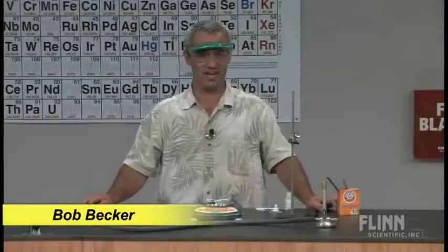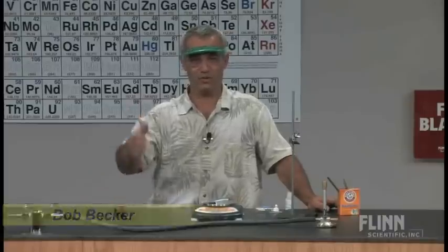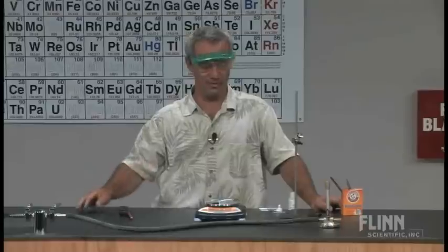So you've just finished covering stoichiometry in your class with your students. They've balanced equations, they've learned how to use factor label to get from moles of A to moles of B. You're looking for a good lab that you might do.